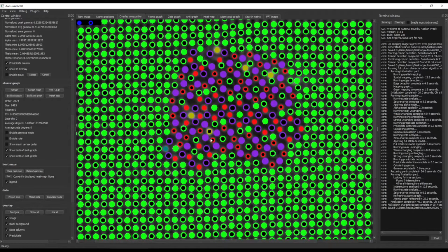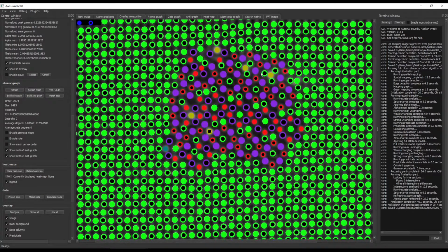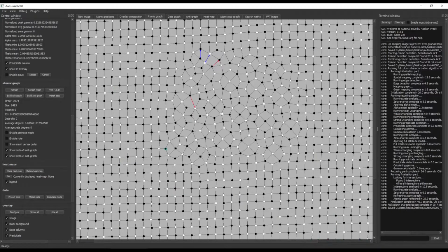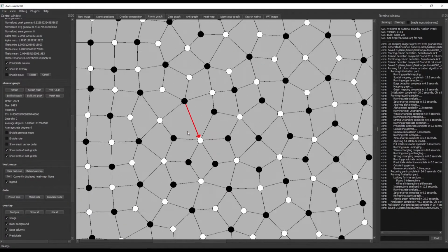And you have 3 here, that looks correct, and 2 here, that looks correct. So now all our silicon and copper should be fine. And so this is all fine and dandy, but eventually you will come across something like this.